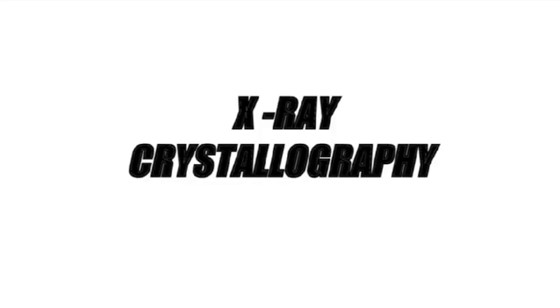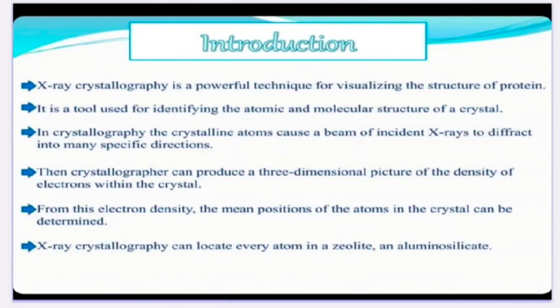X-ray crystallography is a powerful technique for visualizing the structure of protein. It is a tool used for identifying the atomic and molecular structure of a crystal. Here, a beam of incident X-rays diffracts into many specific directions. We can obtain a 3D picture of the density of electrons within the crystal. X-ray crystallography can locate every atom in zeolite and aluminosilicate.